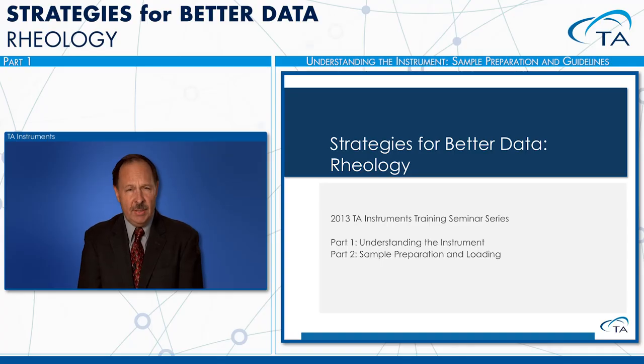Welcome, and thank you for joining us for the presentation on strategies for better rheology data. The presentation is divided into three segments and will be presented by TA Rheology Specialists. The first segment will deal with understanding the instrument and sample preparation and loading.